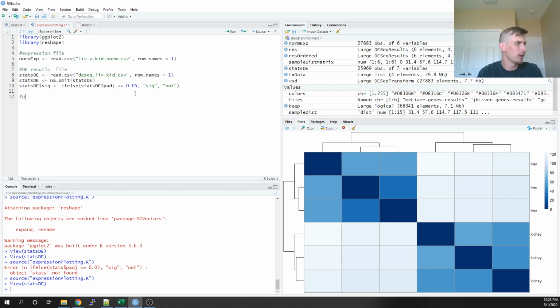It's just that plot in a graph that we did on Wednesday. All this plot is, the x-axis is a log transformed mean expression value, and the y-axis is the, what is the y-axis? It's a log fold change.